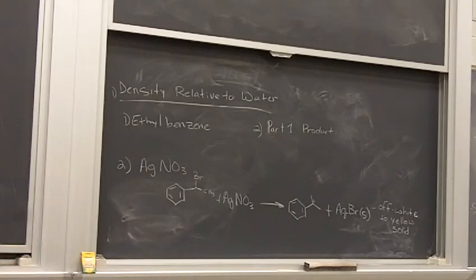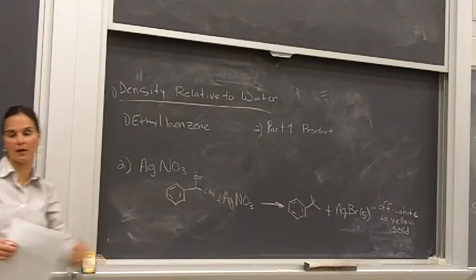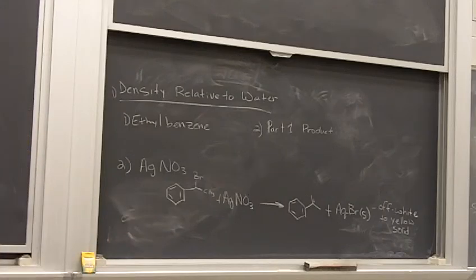So then next week, regardless of what your product looks like, which probably at least half of you, it may turn a little color, so that's fine. We'll keep going with it, and then we'll see how much styrene we get out of there, and then go on to make our polystyrene.